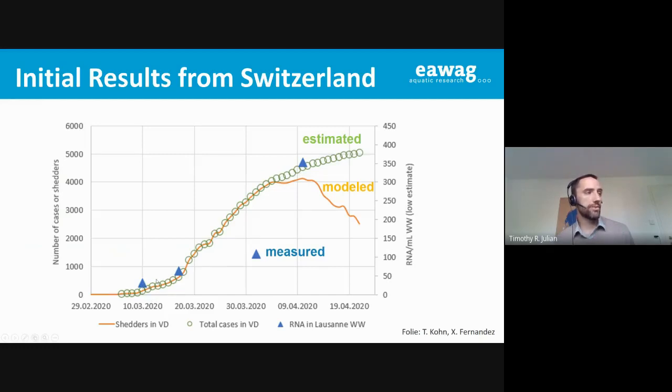And so you see that it's very, very low for the first 2 dates in March. And on the 3rd date, it stays relatively low, and then it jumps up towards the end, the 12th of April. And so what this shows is that there's some sort of trend, but that, again, it doesn't track perfectly, and there's some issues we're having with the samples, and it all relates back to the combination of the concentration and inhibition, but it might also be natural variation, and these are outstanding questions that we have.